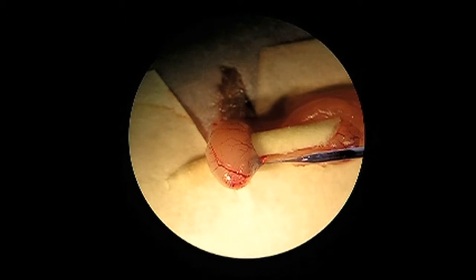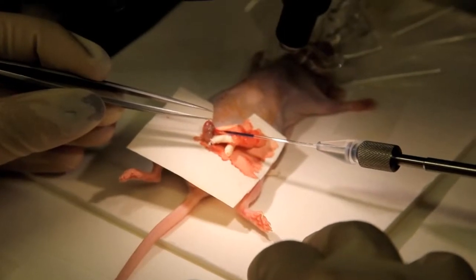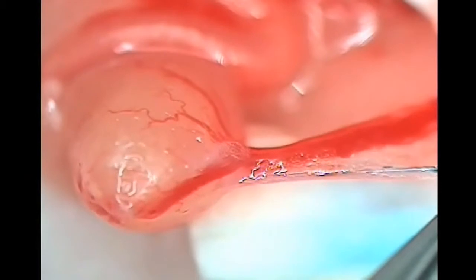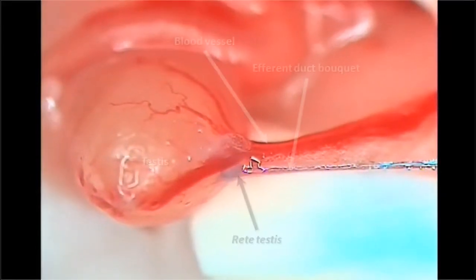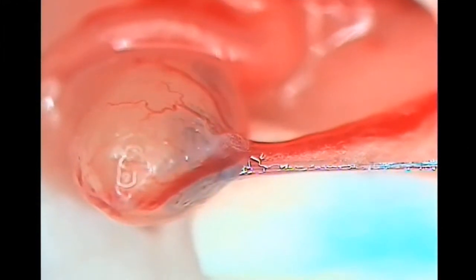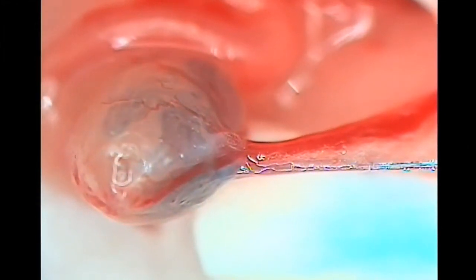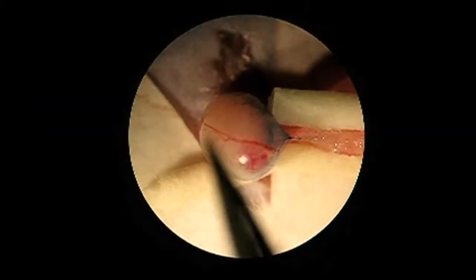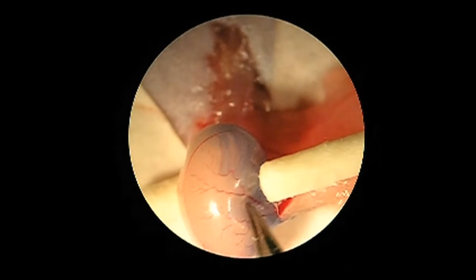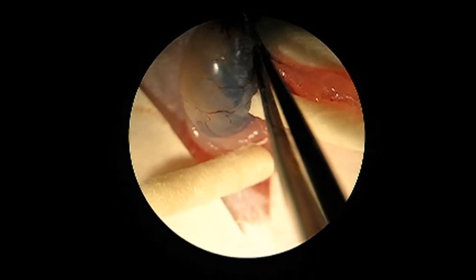Increase pressure gradually and check how seminiferous tubules start to be filled with the blue staining. Continue until the needle is empty. Here you can visualize the injection process with higher resolution. Usually, the rete testis can be visualized as a small clear zone at the intersection of the testis and efferent ducts, which fills up just before the blue staining starts to be distributed along the seminiferous tubules. The injection is complete when 60–70% of seminiferous tubules visible on the surface of the testis are filled with blue dye.